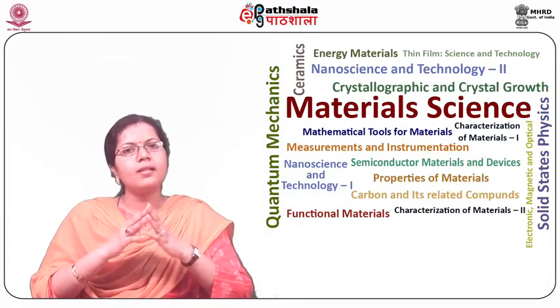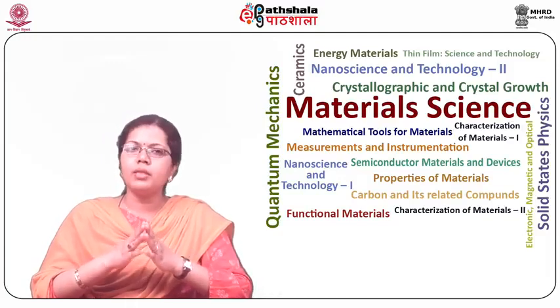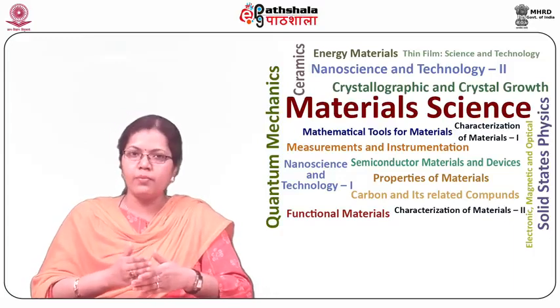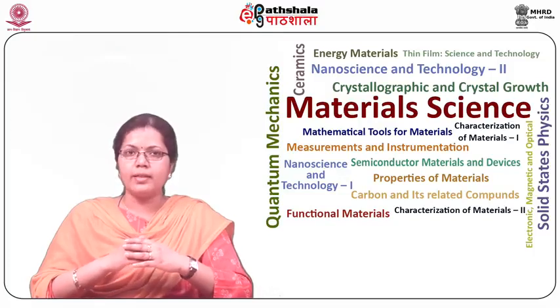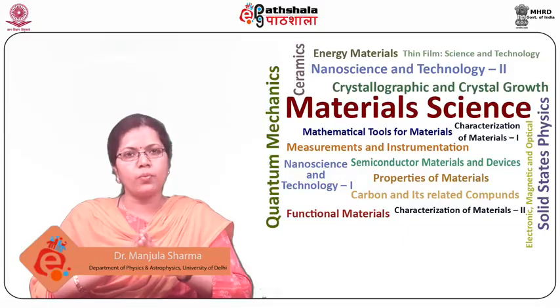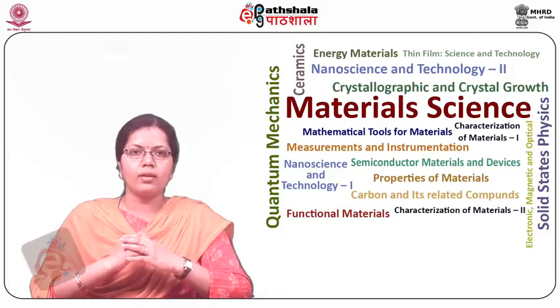So students, let us summarize what we have learned in this module. We learned about the optical microscopy, in which we covered the geometrical optics, its magnification, resolving power, the depth of field, and the contrast. Secondly, we studied about the bright field microscopy, in which we covered its light path, the performance, and the advantages. Thirdly, we studied about the dark field optical microscopy, in which again we studied about its light path, the performance, and the advantages.